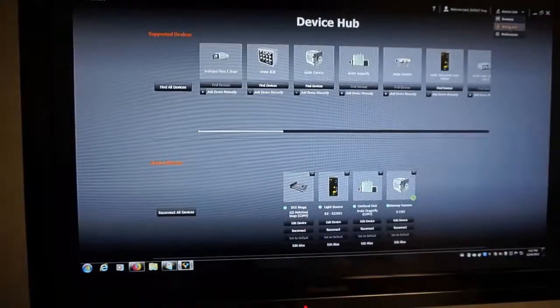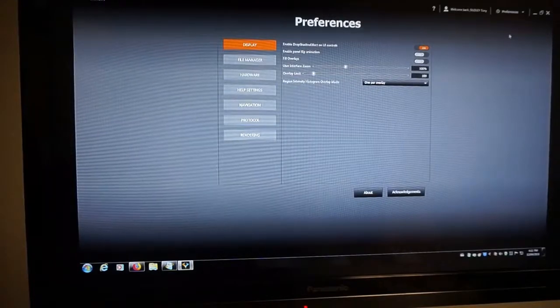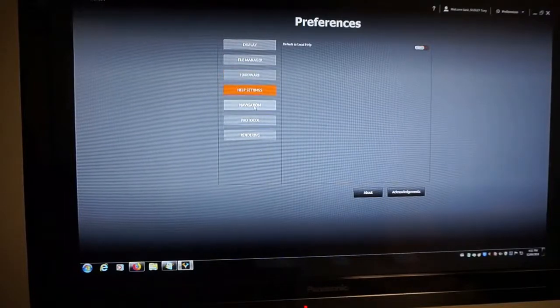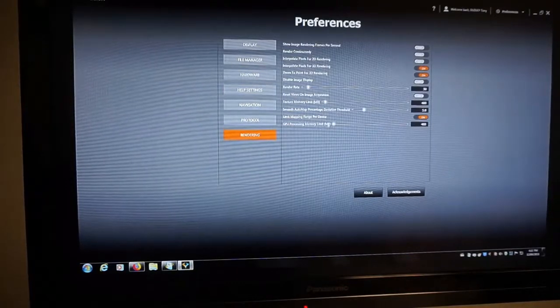Okay, before I go to imaging, I'll show you the Preferences tab because for optimum display and rendering of 3D objects, there's a combination of preferences and settings that you need to set. So just trying to remember, like rendering. Okay, so there are rules for setting what the rendering rate and the memory should be as well.